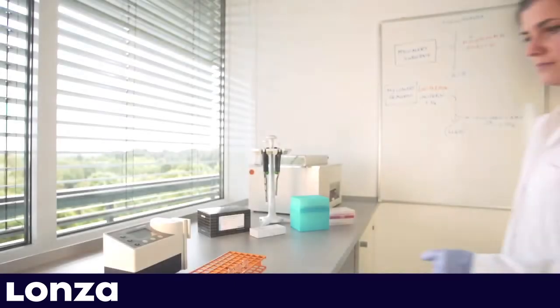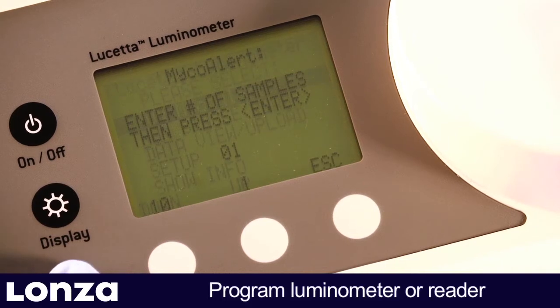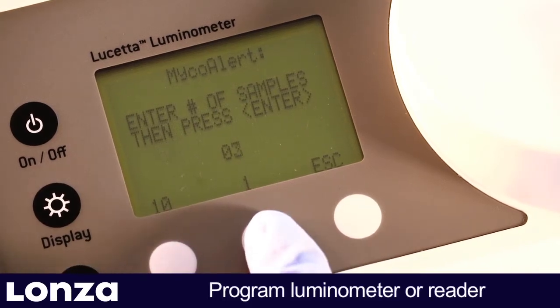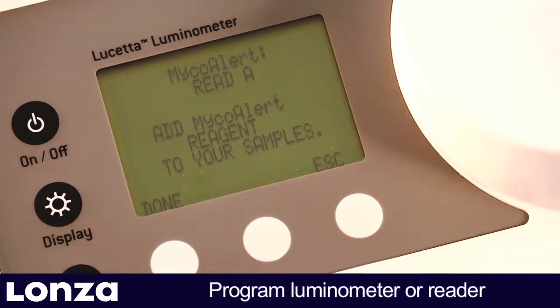As a first step, program your luminometer or multifunctional reader. Lanza's Lucetta Luminometer has a tailor-made MycoAlert mode that guides you through the protocol and calculates the ratio.